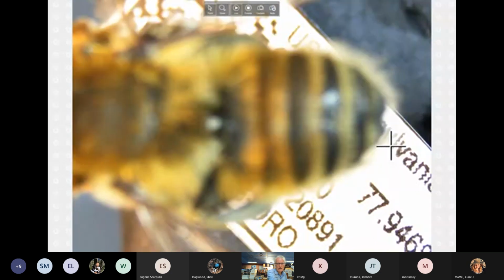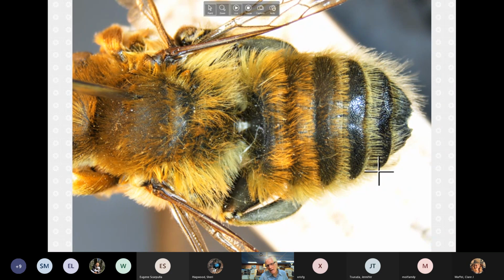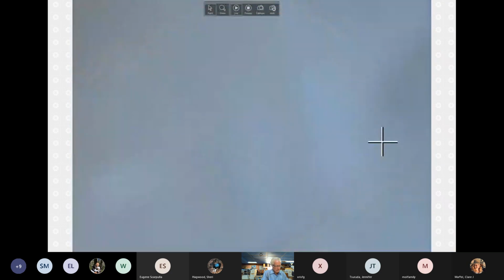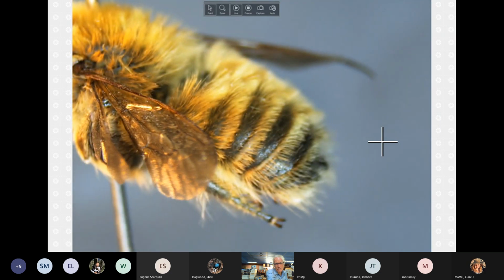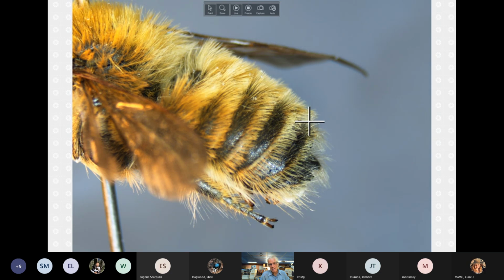Yeah, I look at other things with the female, but so here, light colored hairs, it does seem to have some, maybe we have to score it for both, but it doesn't really have the same presentation. But now that I'm looking at it, you can make out, at least on here, some strengthening of the banding along the rims. But most of the rest of the hair here is all light colored hairs that are, again, when I'm looking at it under the microscope, it seems to be pretty clearly just all one big blob of blonde hairs.